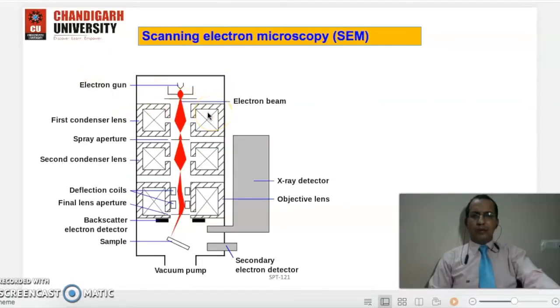Well, we have left our discussion at the point where we are familiar with the basic principle of the optical microscope, and what the essential difference is between the optical microscope and the electron microscope. So now let's come to the instrumental setup. I already told you that the electrons are emitted from the electron gun, and then you have the sample, and in between you have the optics, whose main aim most of the time is to deflect the trajectories of the electron beam.